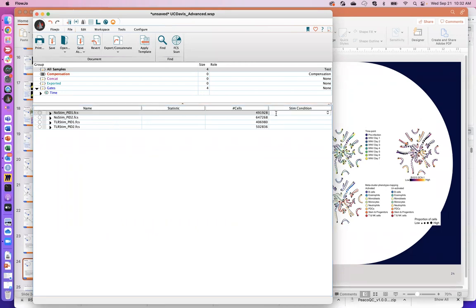So what I recommend that you do here is that you use non-zero integers for the designations. Okay, so non-stimulated, we're just going to assign the value 1. Stimulated with the TLR agonist, we're going to assign it the value 2. If I had other files in here that were maybe stimulated with LPS or IL-1 or TNF or something like that, I would just continue to add numbers to the list. So if it was LPS, then I would assign 3. If it was TNF, I'd assign 4, and so on. Okay, so annotate the data using numbers here to describe the different conditions.